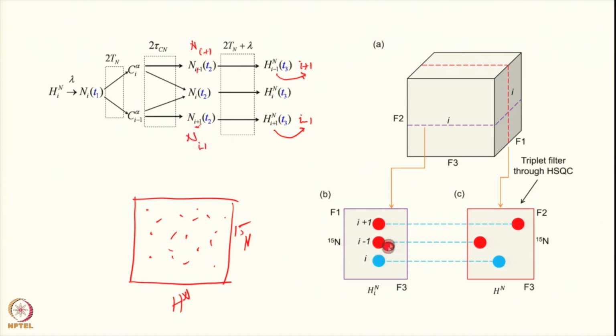Here you do not worry about the C alphas, and the N15 dispersion is always very good compared to the C alpha chemical shifts in most proteins. Particularly in intrinsically disordered proteins or loop segments in proteins, you have poor chemical shift dispersion for the C alphas, but the N15 dispersion is always good. Therefore you can see this kind of peak separation in every case.